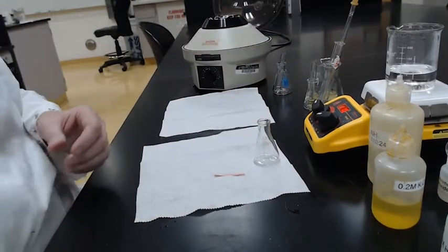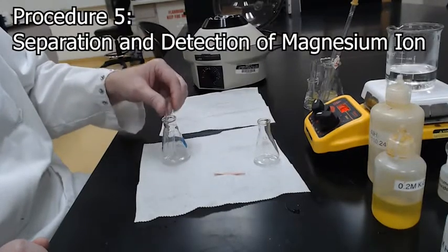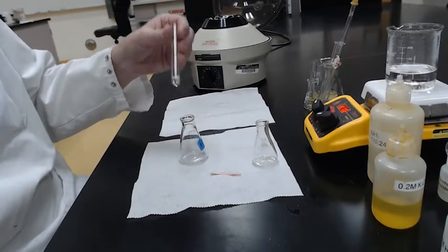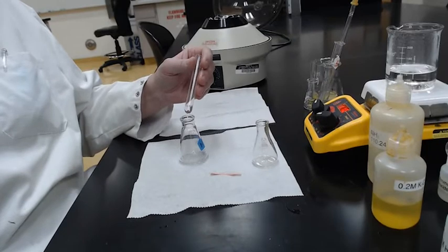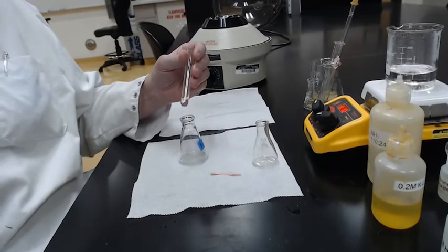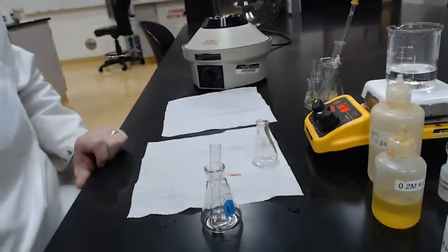Let's pause now. That was procedure 4. We're now going to move on to procedure 5, with the liquid from the very beginning, the supernatant. That was this liquid right here. This liquid has a possibility of potassium, sodium, and magnesium ions. Of the three, potassium and sodium are impossible to precipitate, so we'll have to separate those out later via evaporation and try a flame test. What we will try to go for now is to see if there's any magnesium in here. And again, if there's no precipitate, there's no magnesium.